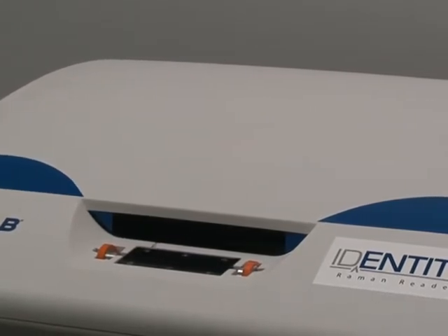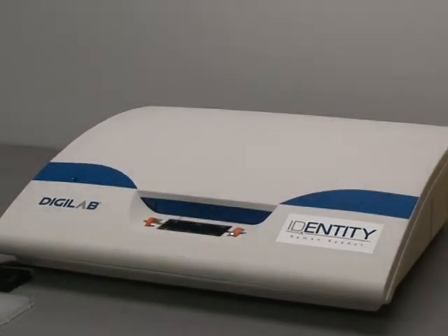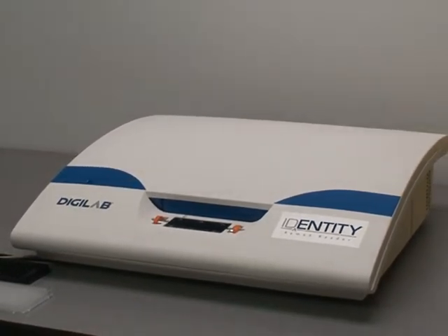It's very unique in that it's the first Raman-based microplate reader to be launched. It's very affordably priced and competitive with most microplate-based readers on the market today.